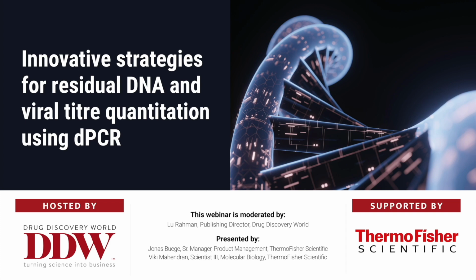Also, dPCR's ability to detect low copy numbers and its resistance to PCR inhibitors makes it a great analytical tool for biopharma. So overall, leveraging digital PCR-based assays enhances the efficiency, reliability and quality of biotherapeutic manufacturing workflows, contributing to the development of safe and effective biopharmaceutical products.